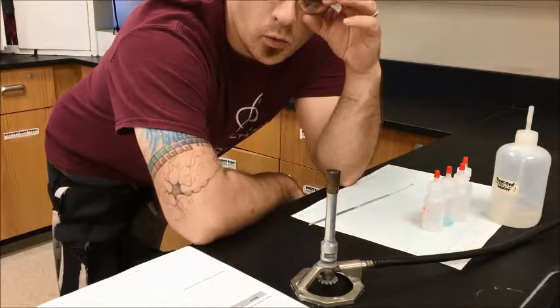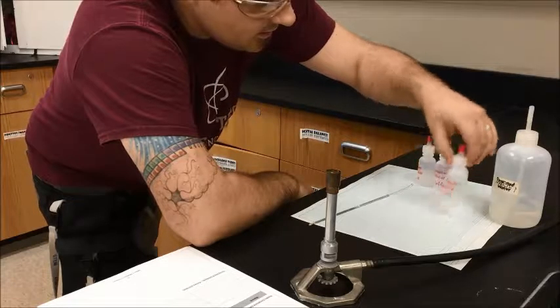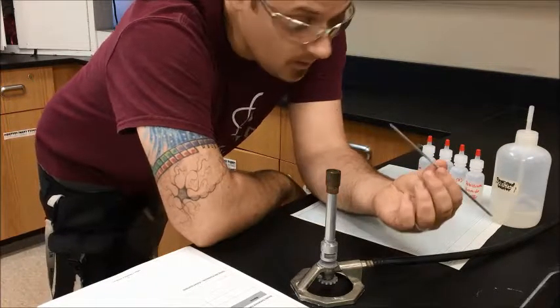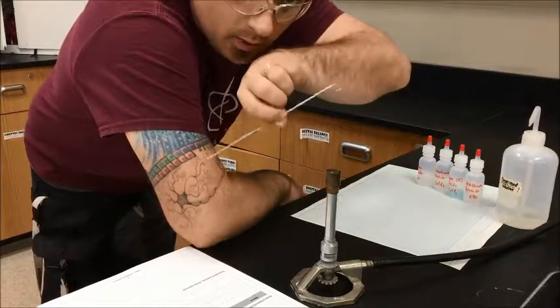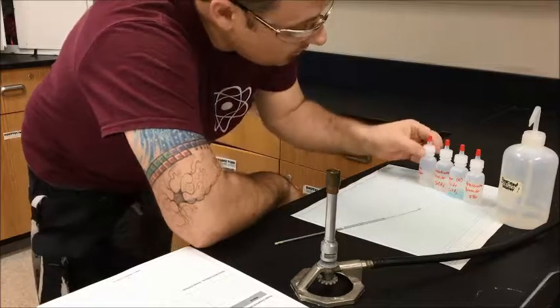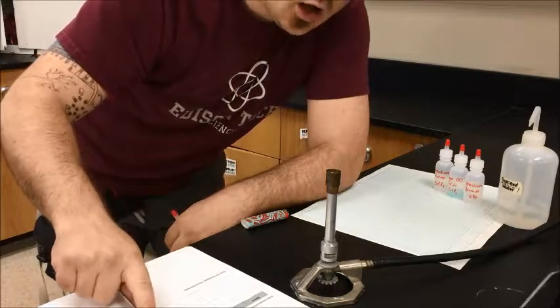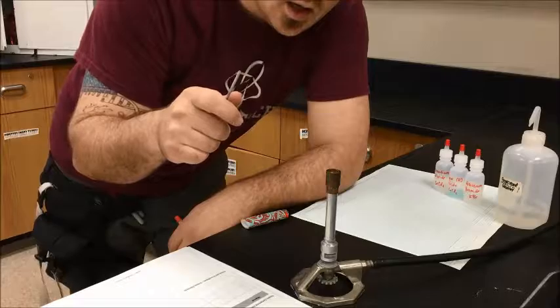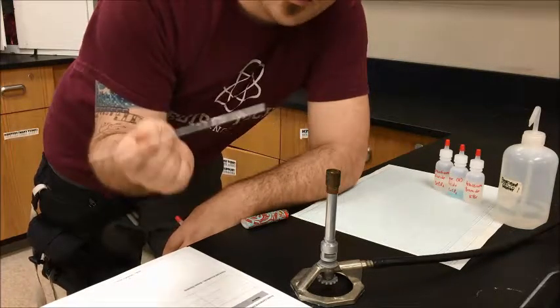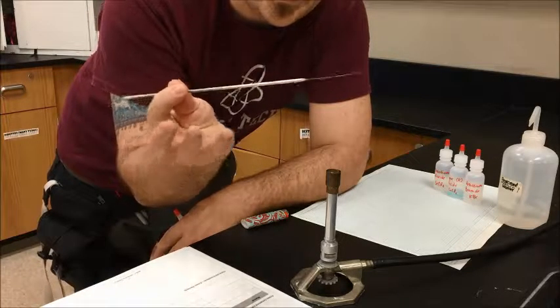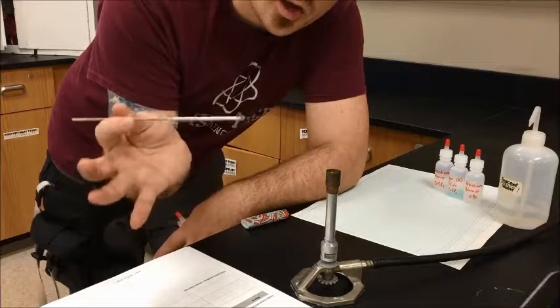First thing you're going to want to do when you get into your lab station is make sure that your table has four known chemical compounds to test, and that you have one of these, a little loop at your station. You also want to make sure the gas is on and ready to go. And you have a wash bottle nearby to wash your loop in between trials. The flame test is actually really simple. All you're going to do is put a drop of the chemical onto the loop and then stick it in the flame. The hardest part is actually seeing the color that is coming off the particular chemical because it's very subtle. I'll show you an example in a second when I turn out the lights, but the loop itself will cause the flame to turn orange. And that is not the color we're looking for. We're looking for other colors, a little more exotic, like purples, greens, reds, magentas, and things like that. So you have to be very careful where you put the loop into the flame so that you can observe the result that we're looking for.